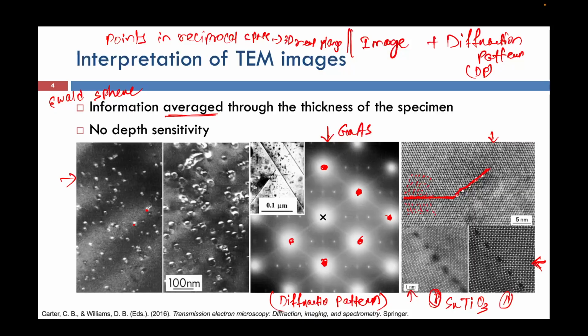completely from the material. However, when we see some of these dot-like structures, we may assume that these features belong to the material, right? That is what we may assume, but we cannot say for sure until we use other characterization techniques in TEM. We cannot be fully certain that these are features of the material. Why? Because these might be different types of damage. We talked about beam damage, right?